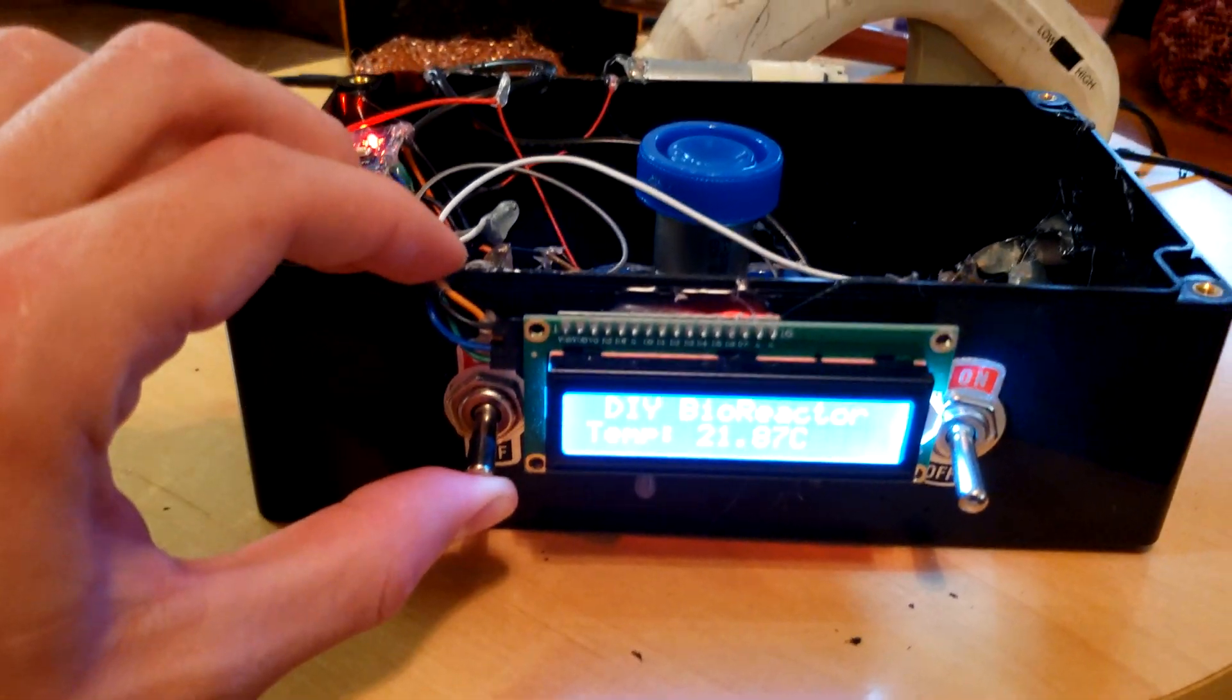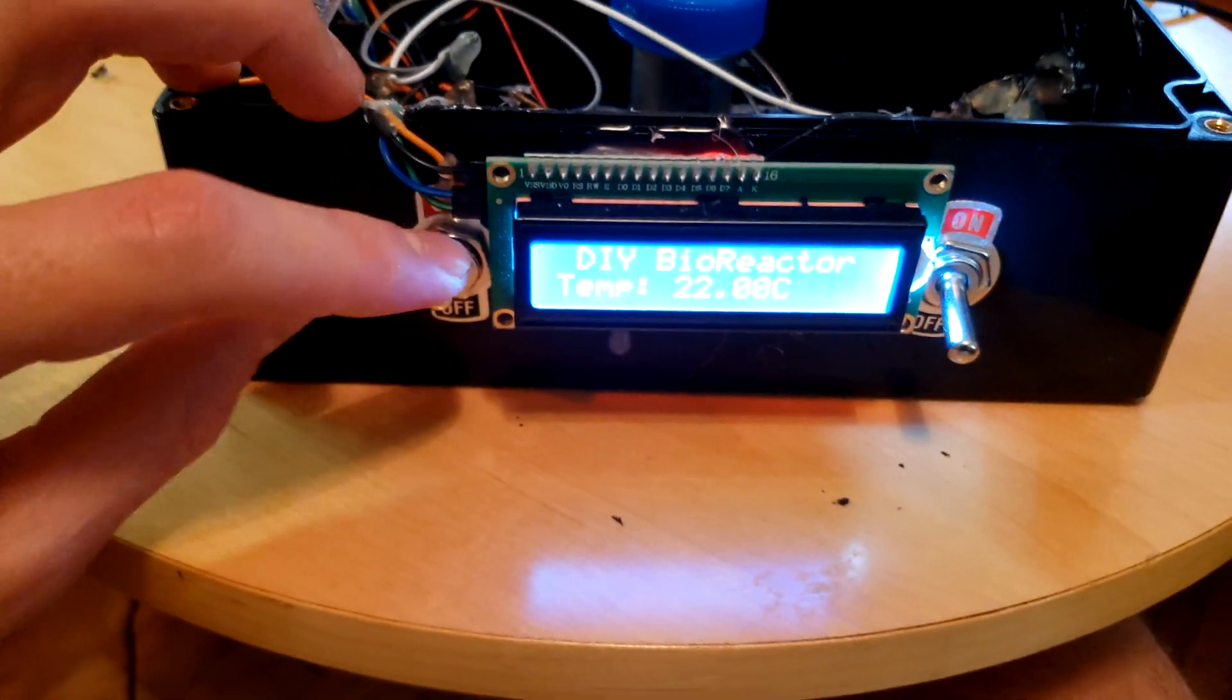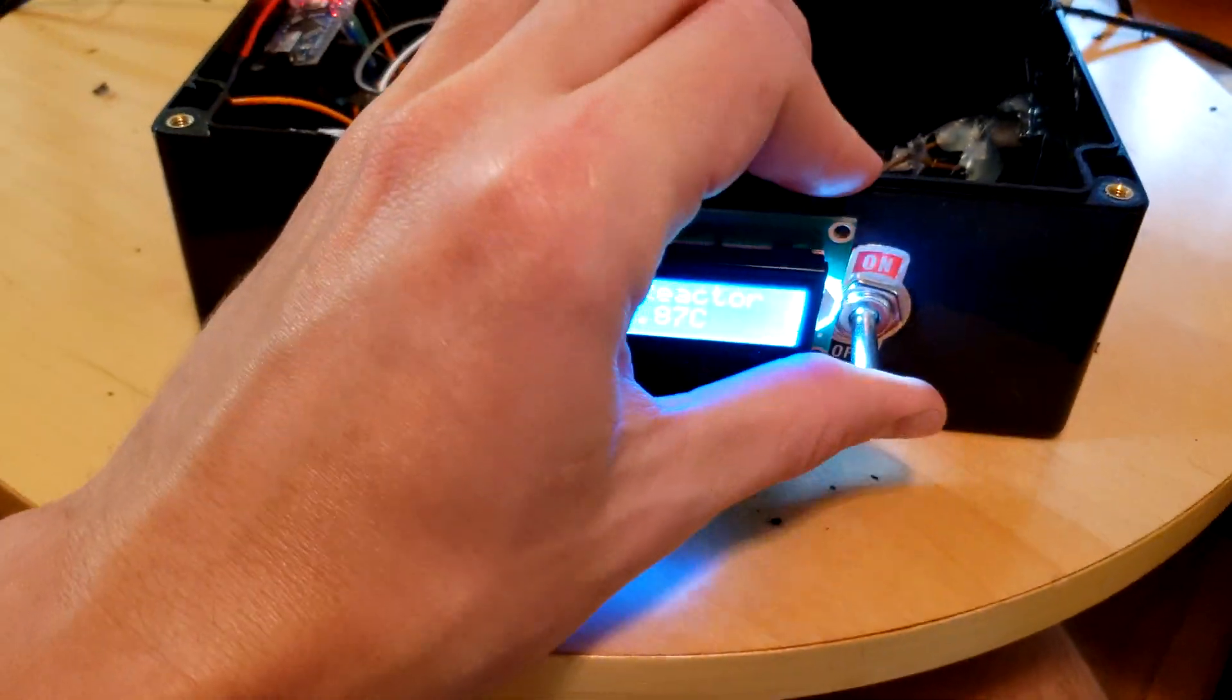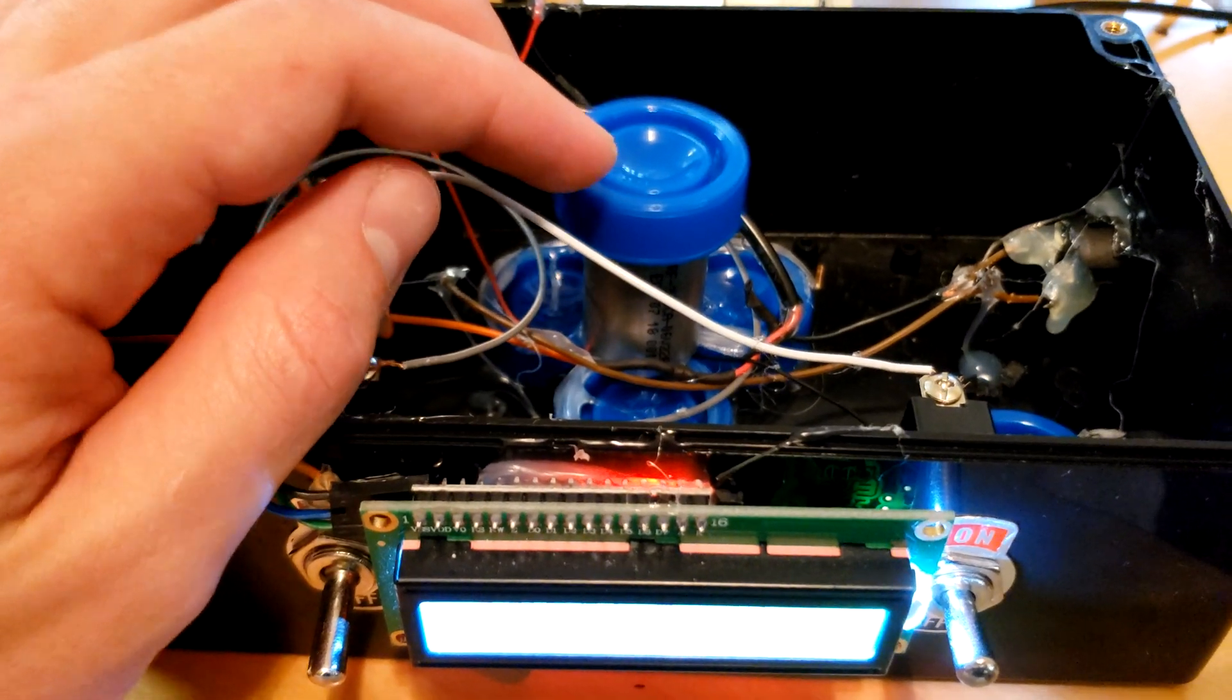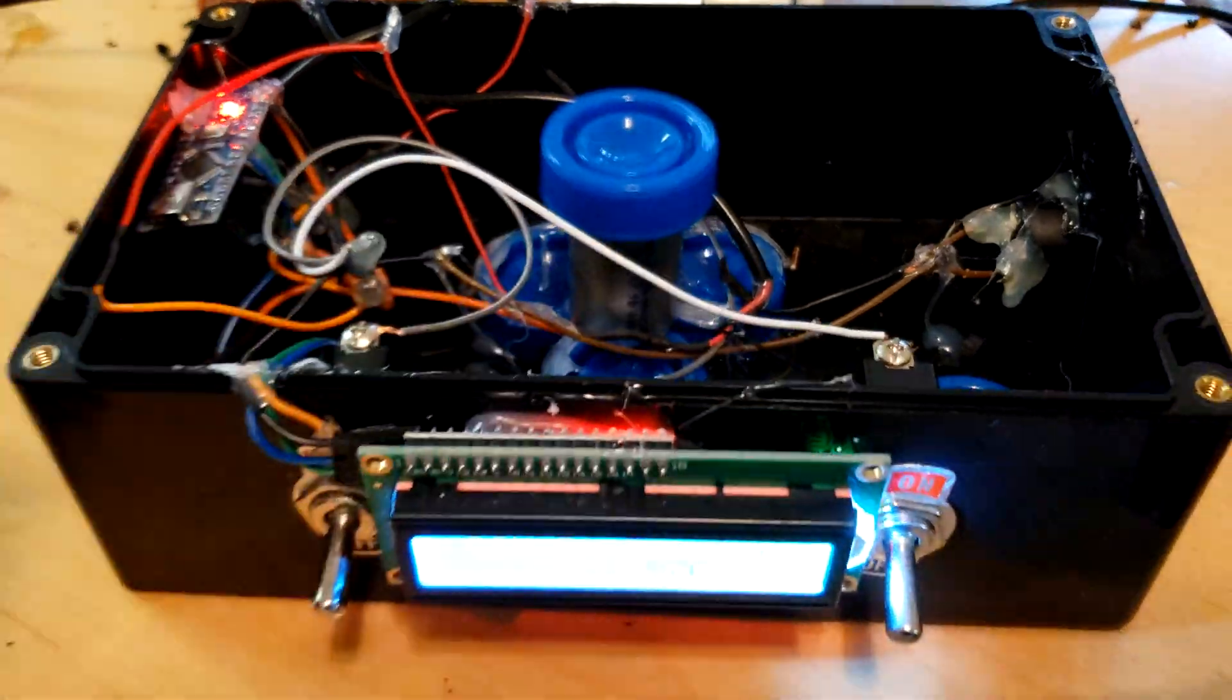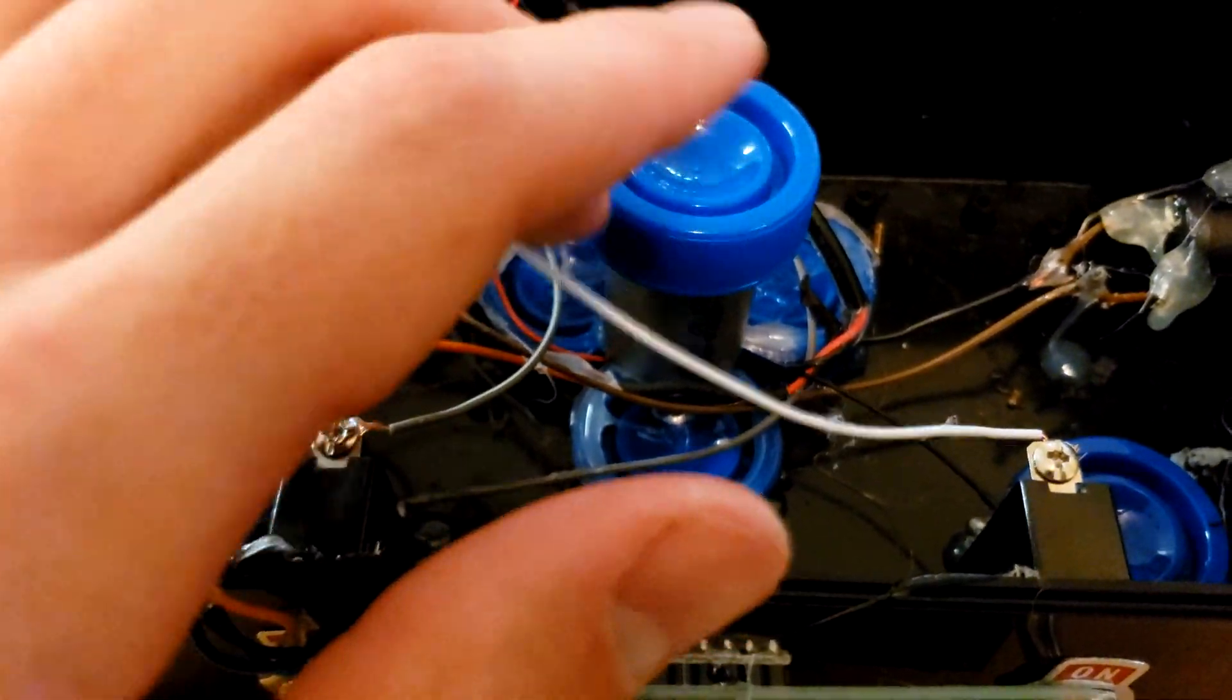Nice. Okay, let's try this switch. Okay, so that's turning on the blower motor. And this one. Okay, so that turns on the stir plate. It looks ugly, but it's actually working pretty well. This motor still may be a little too fast.